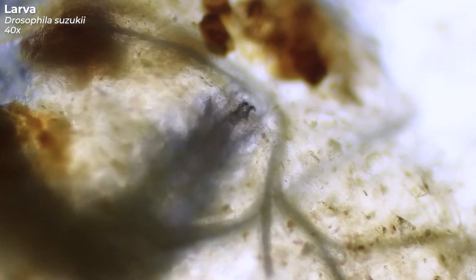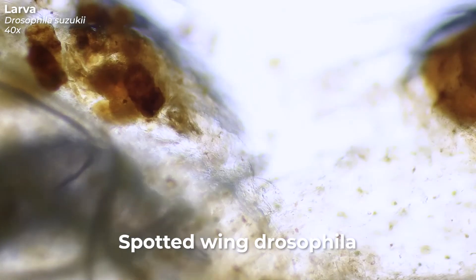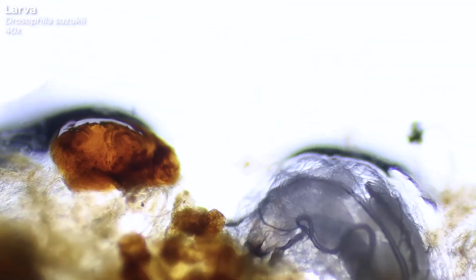This voracious alien-like maggot is the larva of the fruit fly Drosophila suzuki, also called spotted wing Drosophila. And let me tell you right away, this species causes lots of trouble. Perhaps you have heard of their related species, the Drosophila melanogesta. This fruit fly is one of the best studied organisms in the world, but unlike Drosophila suzuki, it doesn't cause any problems.